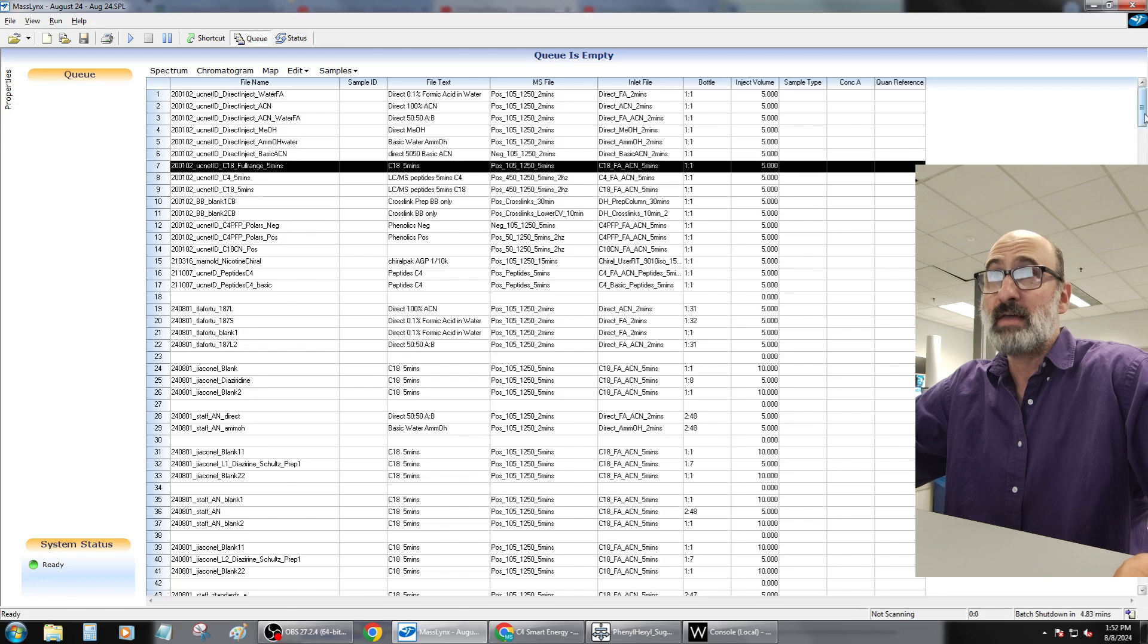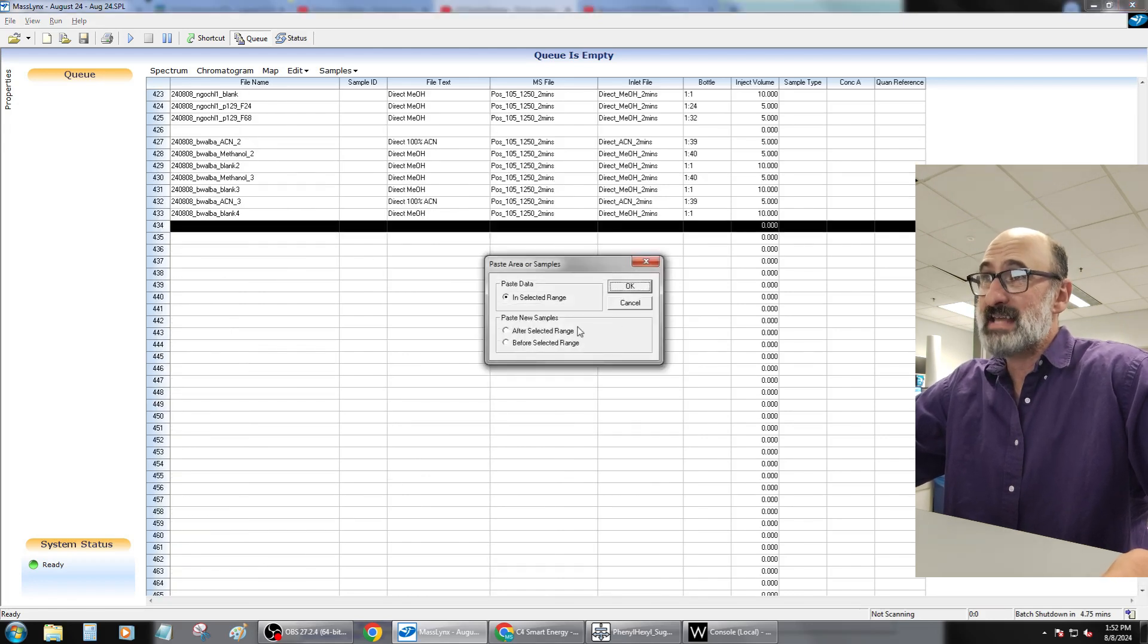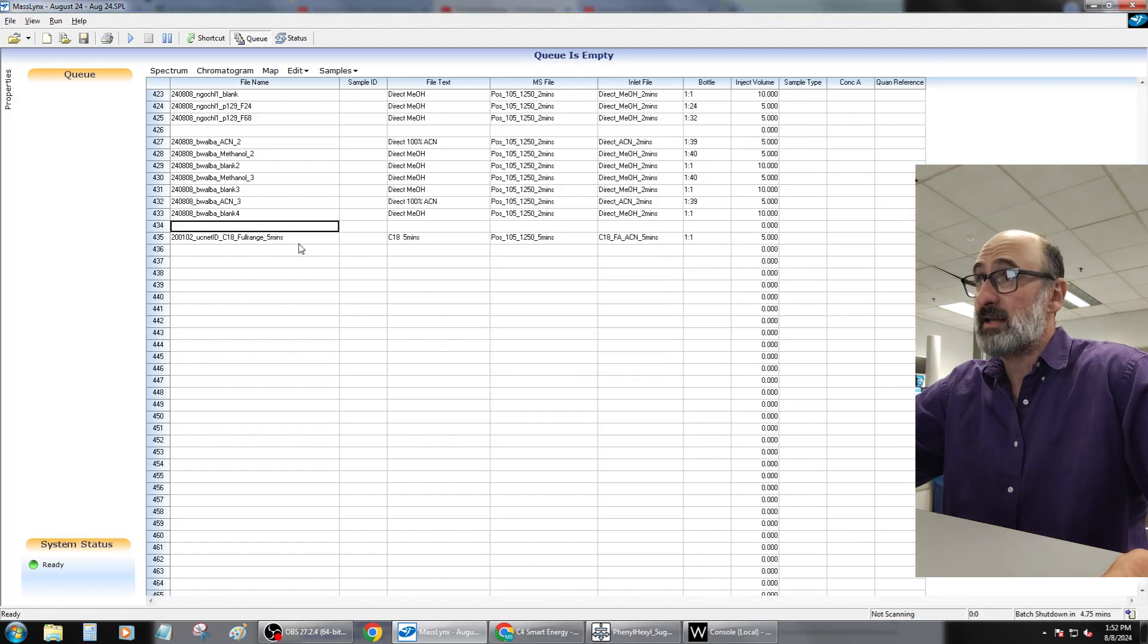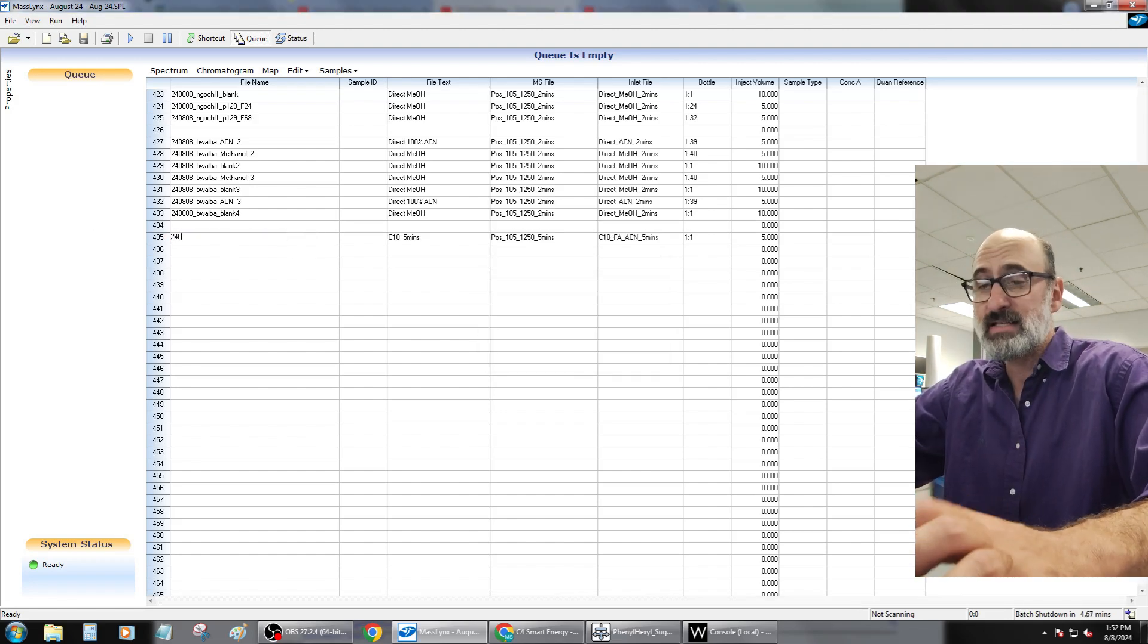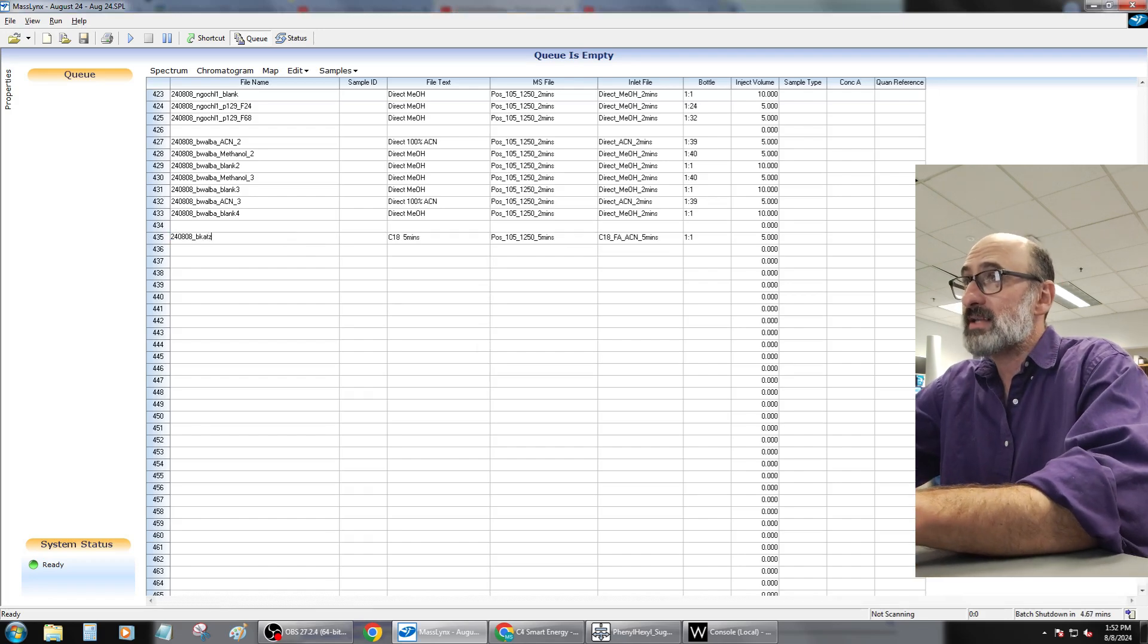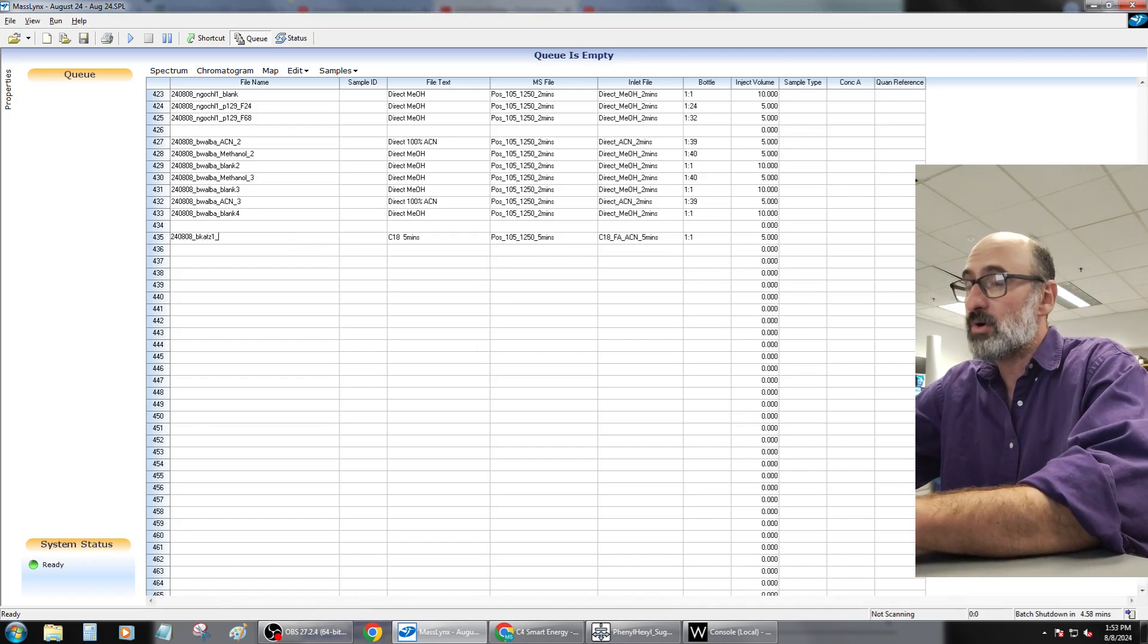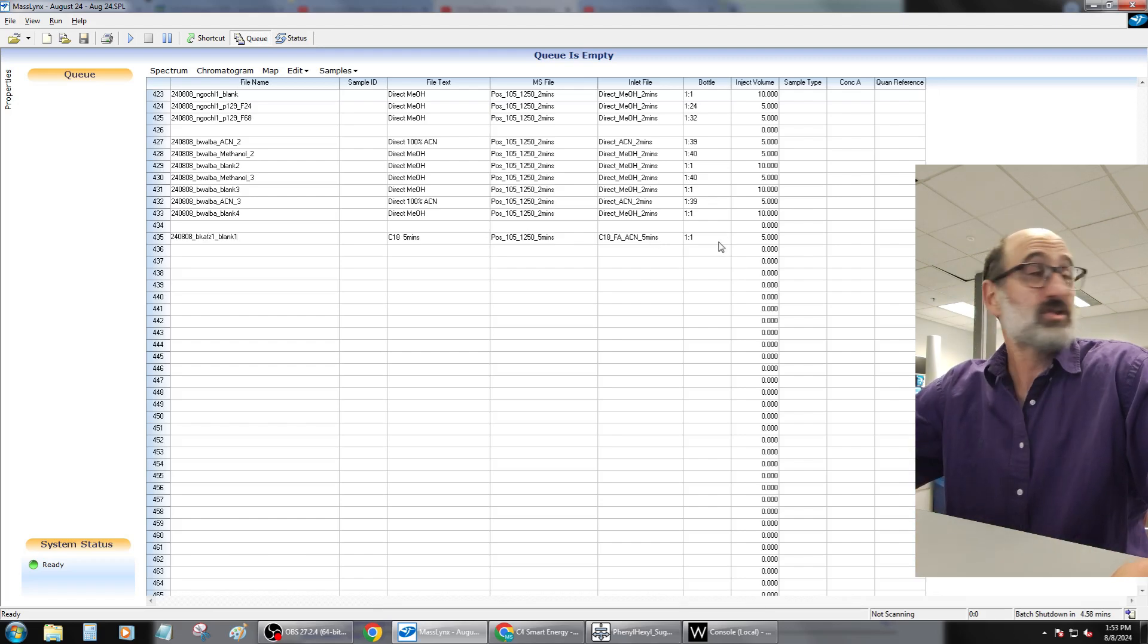We're going to copy that, come down to the bottom of the list, and I like to do the paste after so I leave that space in the lane. Then I'm going to go ahead and name this today's date, and then we're going to call it BK. That's who I am, and then we're going to do a blank.